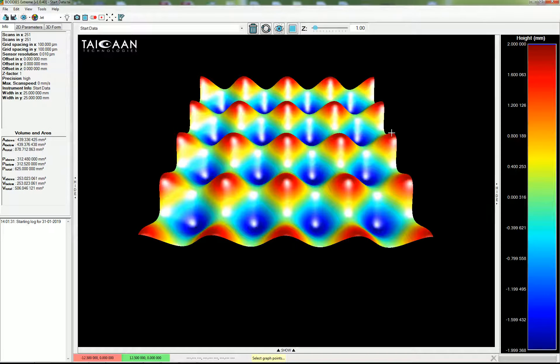To the left we have a series of dialog boxes, which I'm pointing to with the crosshairs. These can be hidden or shown and expanded by clicking on one of the windows. The upper one contains information about the dataset. Beneath that we have a calculation of area: S is surface area, P is projected area, and V is volume. Below that is a dialog box showing the time, date of loading, and the workflow being applied to the data, so you have a record of all actions taken.